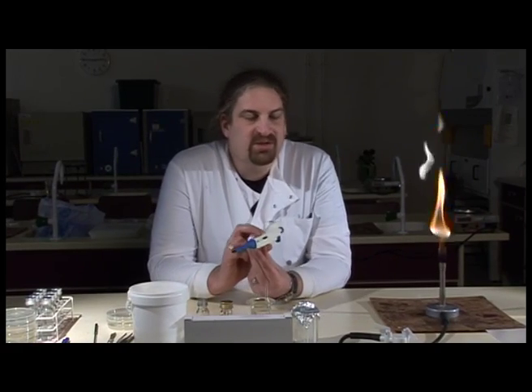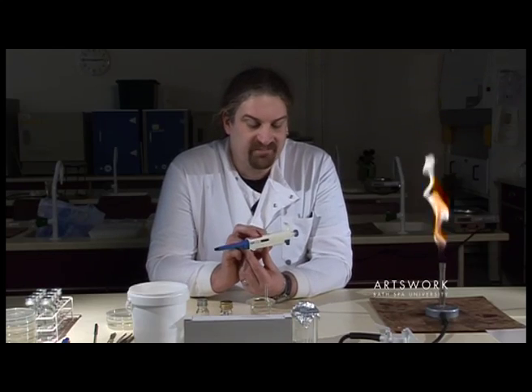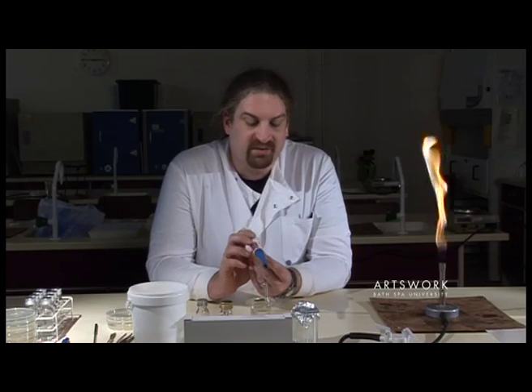What we're going to look at today is just how to safely and accurately use one of these pipettes. We use these regularly for transferring samples in microbiology.